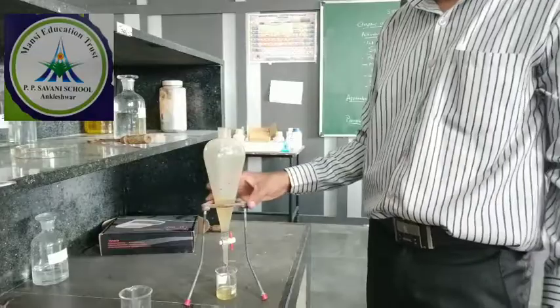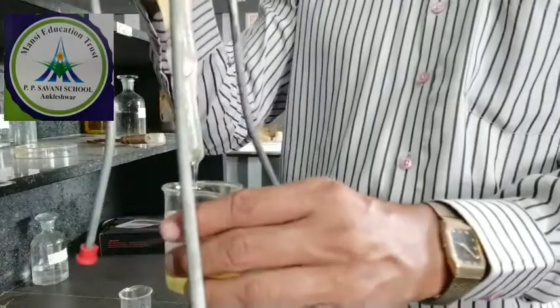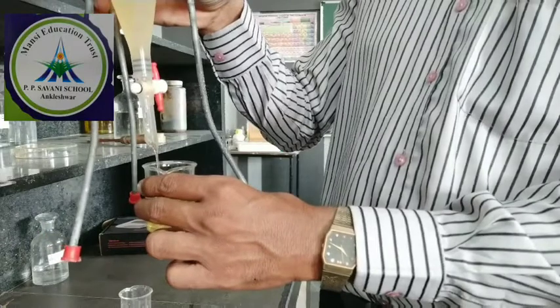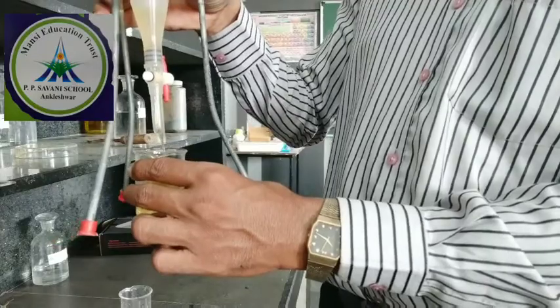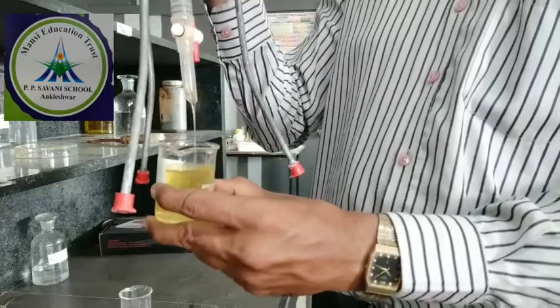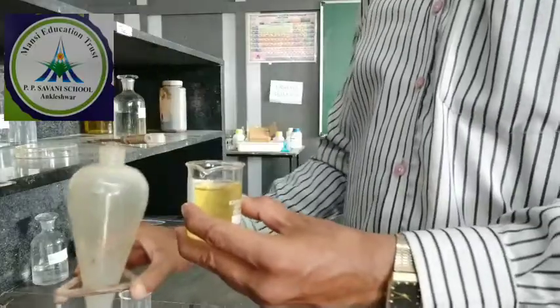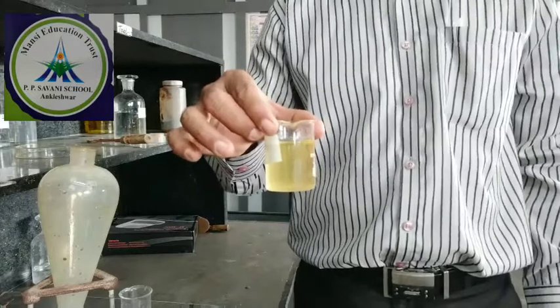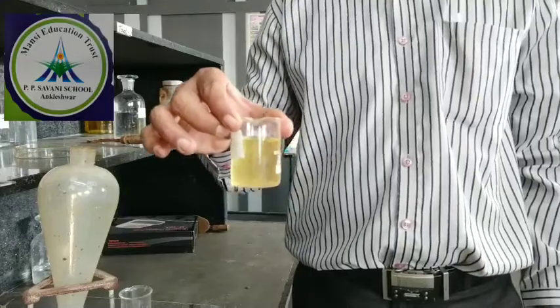So you can see now oil is coming out. The yellow colored oil is there in the beaker. So oil can be separated out when it is mixed with water. So two immiscible liquids can be separated.